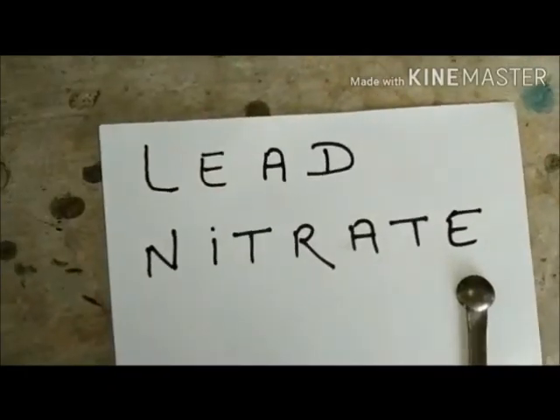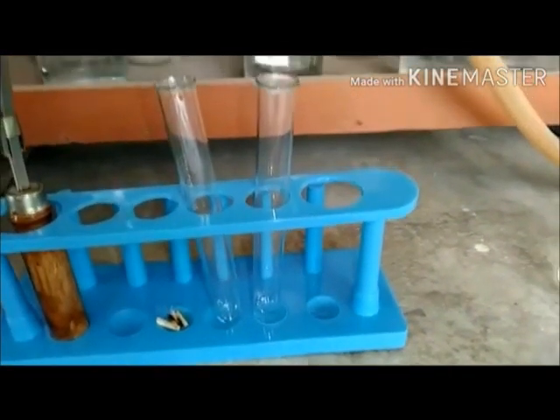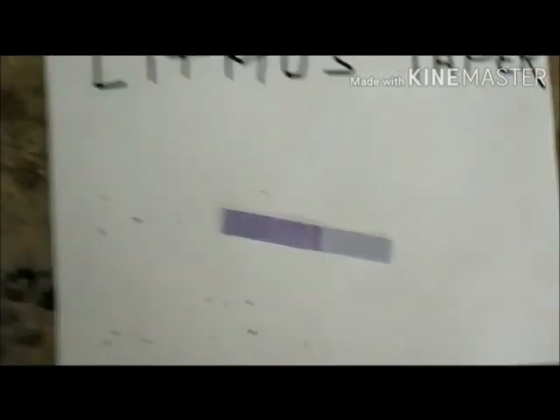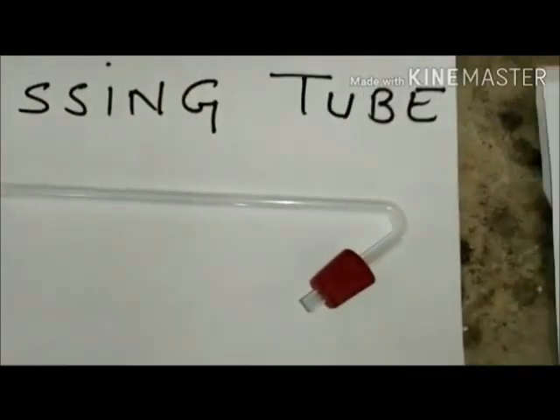In this experiment we have taken lead nitrate, which is a white crystalline solid, two test tubes and a test tube holder, freshly prepared ferrous sulphate solution, a blue litmus paper which is moist — that is, we have dipped it in water — a passing tube along with a cork placed on it, and a Bunsen burner.